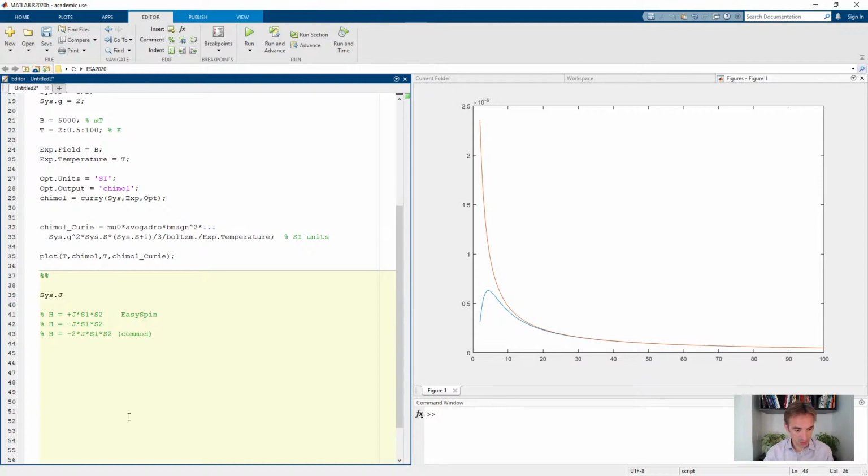Let's make an example here. Two coupled spins. We're going to start out clean again. We don't need this here. And specify two coupled spins 1/2 for simplicity, 1/2, 1/2. Let's have both of them have g factors of 2.